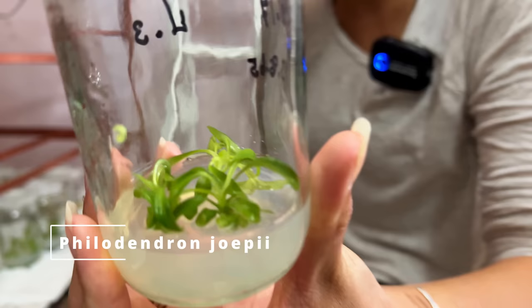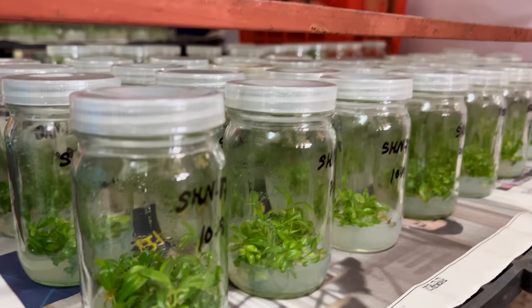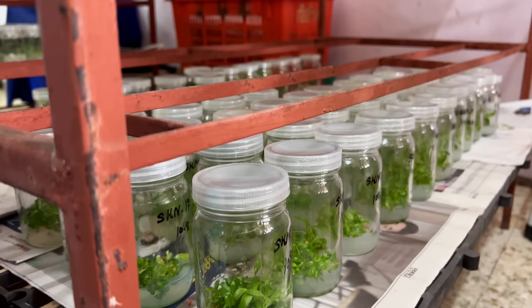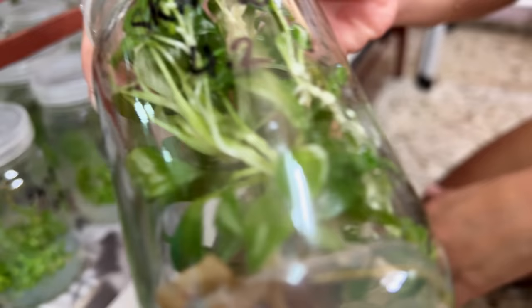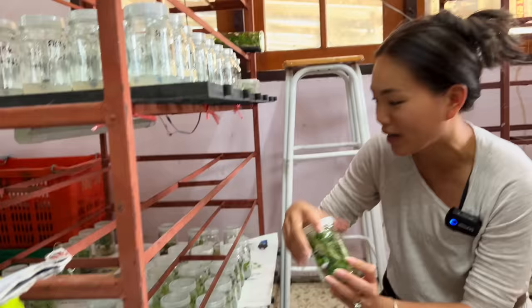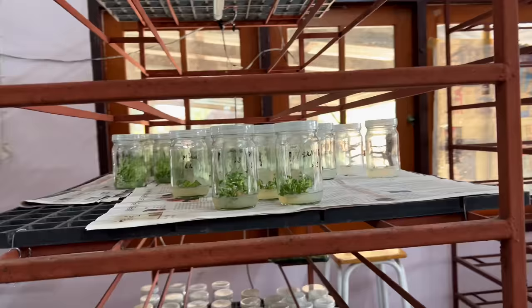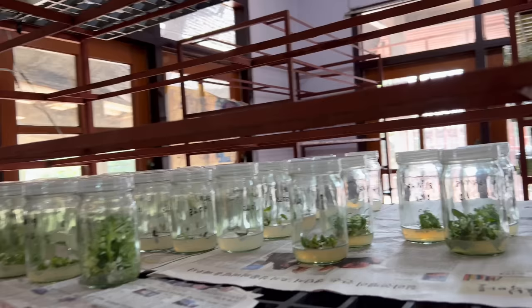Jopii! This one is not variegated — maybe I'll find one in here. Usually there's at least one if you're diligent enough. It's a gamble for sure. But they're coming into the market quite hot — the variegated ones. You can see it's outgrowing like crazy. Is this a White Princess or White Knight? I'm not sure, I have to double check. Sometimes it looks like one but when I check the code it's wrong. These are kind of where new variegations come about. We're seeing some variegated plants start appearing in green walls because they're not as expensive as before, so people can appreciate their beauty and display them wherever they want.